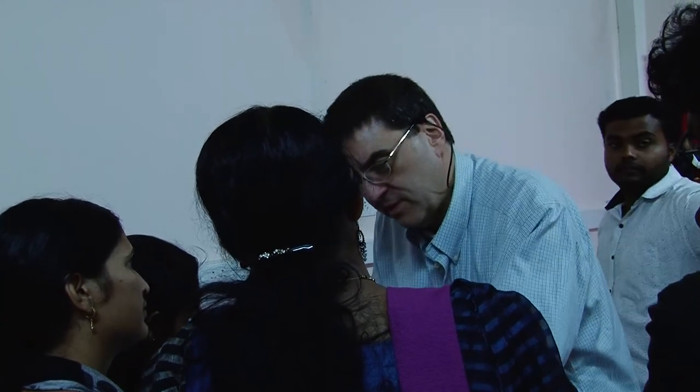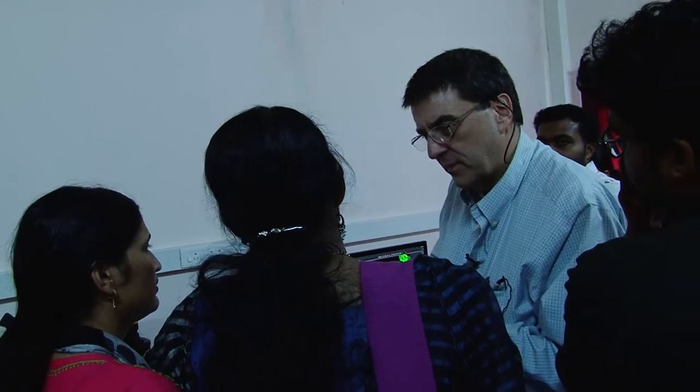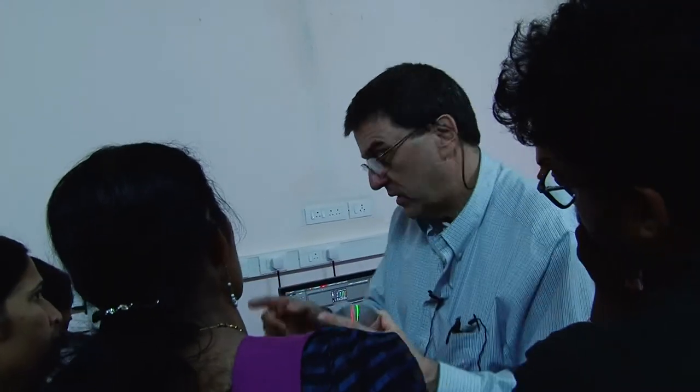Okay. Your excitations are so close. When you excite the FITC, you're going to excite the other too. And they're both going to sort of bleed into each other. I mean, it might not be 100% bleed, but it's going to be hard to tell, hey, is that really FITC we're looking at? Or is that really PE we're looking at? It's going to be hard to tell the two apart because they're so close. That's why I was saying, it'd be nice if you had like a 488 and then like a 647. They'd be really far apart, and then you wouldn't have this problem.